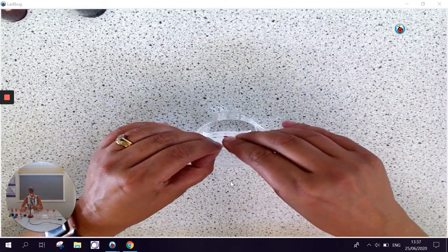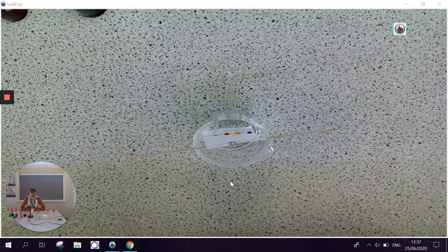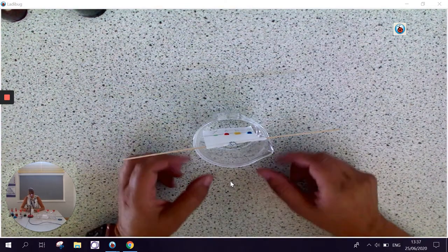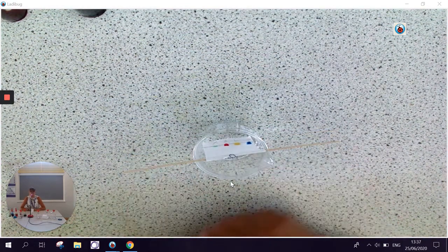We then leave that for a few minutes until the solvent has travelled all the way up the paper.